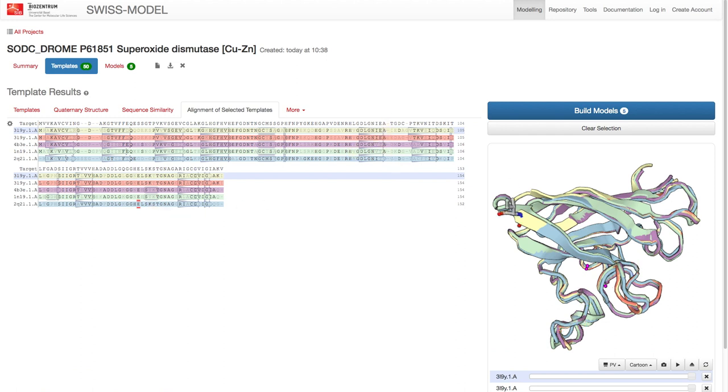The difference in the sequence alignment means that the modeling engine cannot rely as much on the template for modeling here, which indirectly explains the drop in quality.